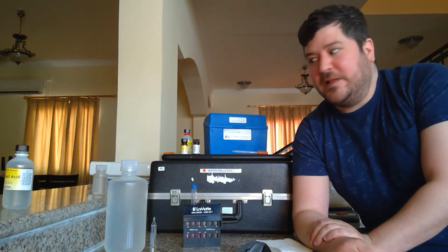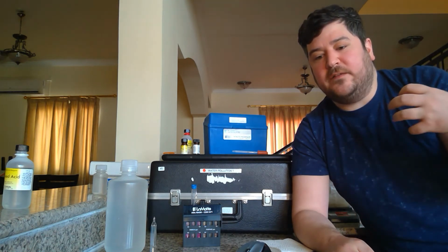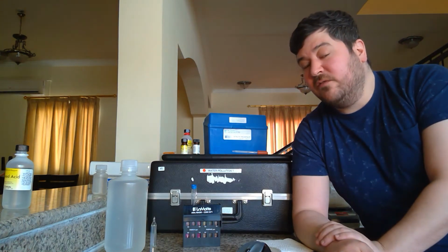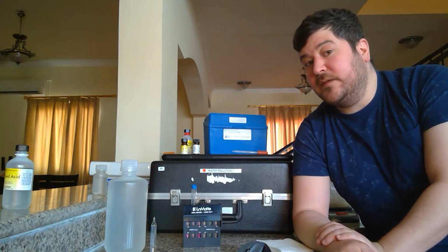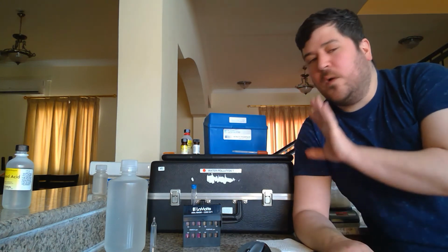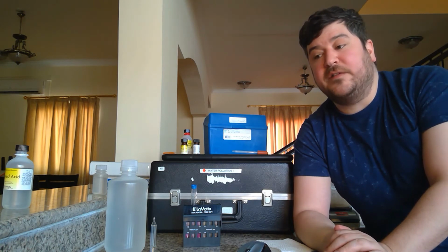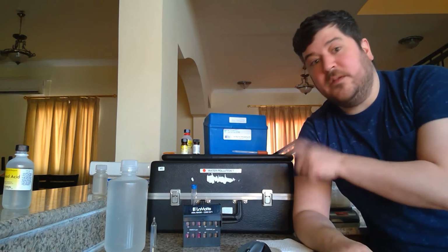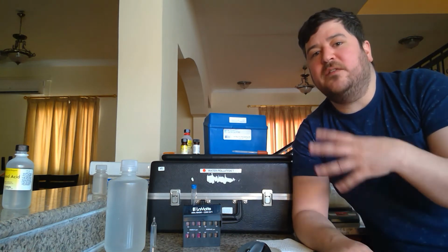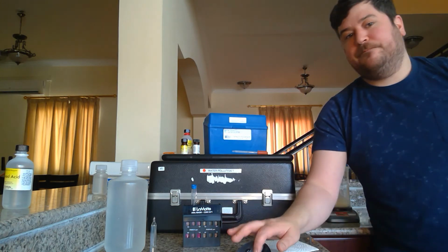This is actually a pleasant result because typically in the lab, when we test the aquarium water and we test the tap water, we don't get results like this all the time. So I'm very interested and happy with these results. So I'll clean up, put more gloves on, and get set up very quickly to do the phosphate test. It's the same as this test, just with different reagents, but still the same mixing and waiting. So I'll be right back with the phosphate setup.